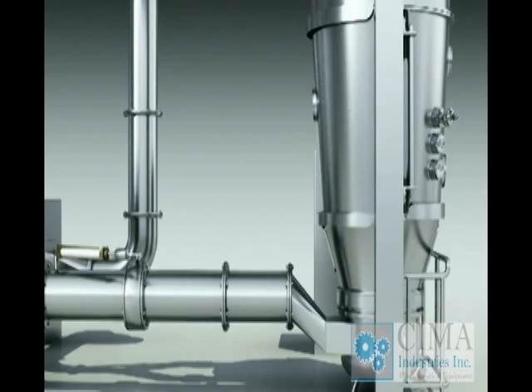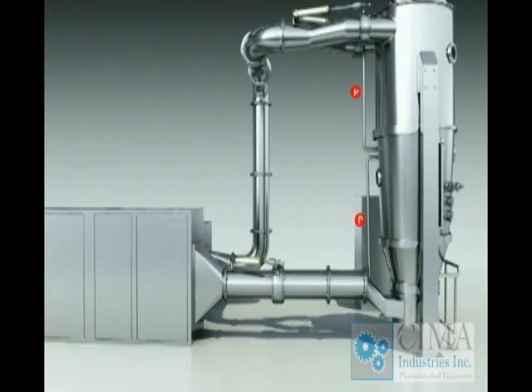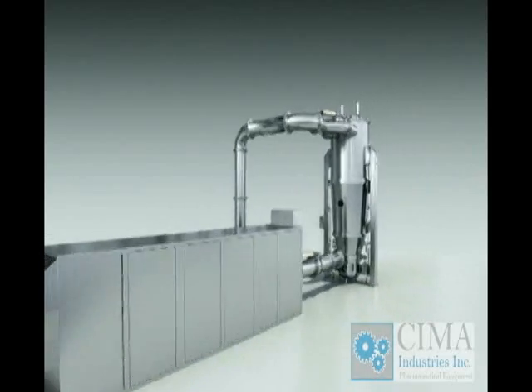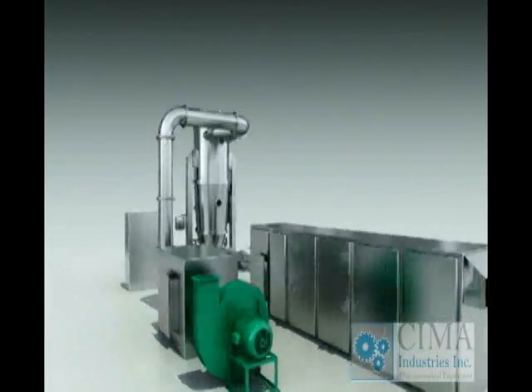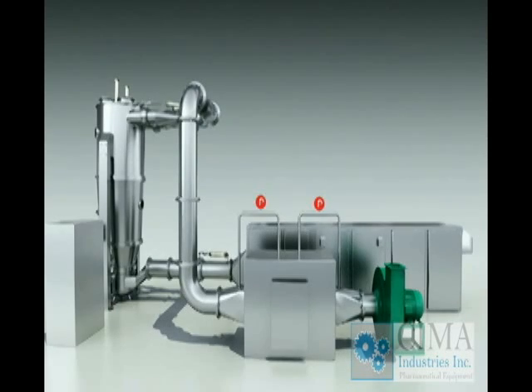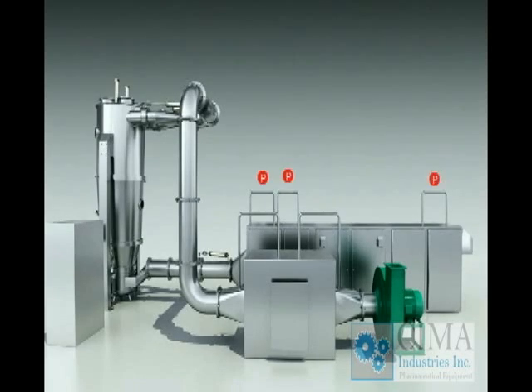4. Pressure differential transmitter or gauge are normally supplied with the air inlet and exhaust filter, fluid bed, and powder collecting chamber, so as to check if there's any blockage or leakage with each section. The ones with the powder collecting cabinets and the first air exhaust filter, if any, are normally transmitters. They should stop the system when any measured pressure difference is out of the set range, so as to avoid leakage of material products and pollution of environment.